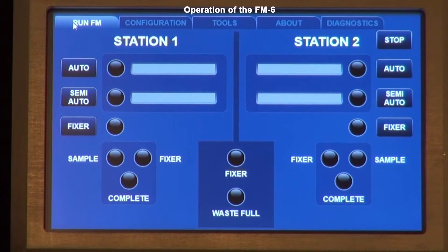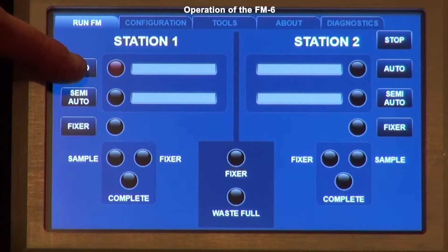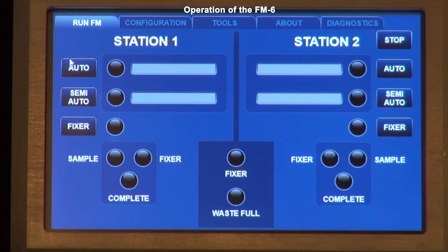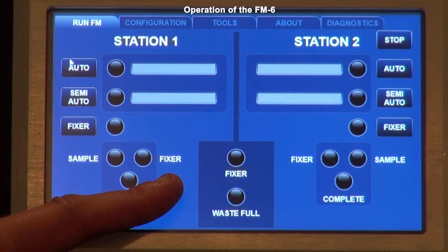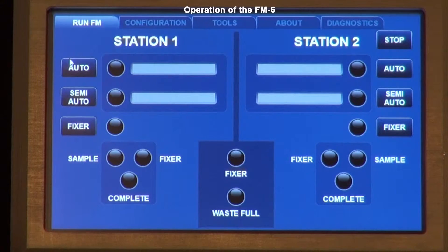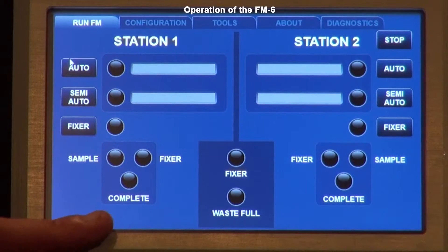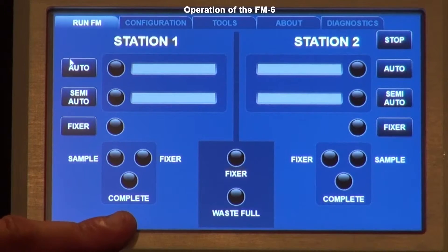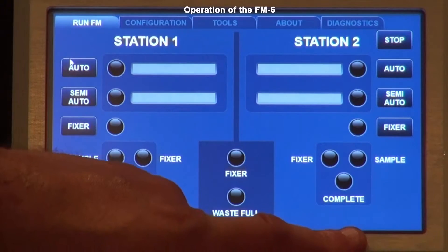If you have a sample in the sample position and the sample light is not green, the unit will not function — if you press a button it will blink red and won't work. Make sure your sample is positioned properly and you have a green light. The fixer light turns from black to yellow during the cycle when the fixer is being dispensed. Once the entire program is complete, the complete light will come on green for each station.